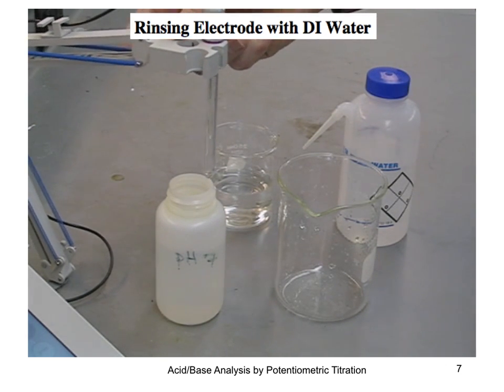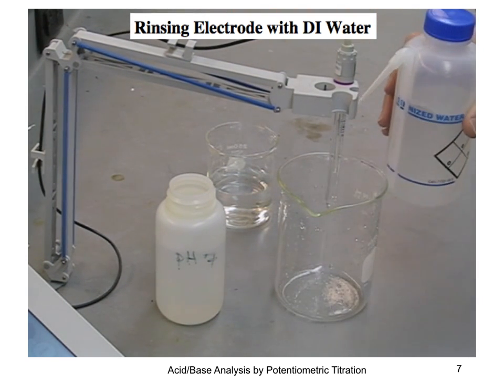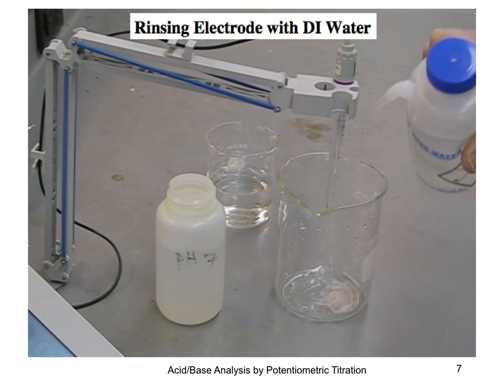Here is an example of how you should rinse your electrode after changing solutions. Make sure to rinse your electrode every time you change solutions.